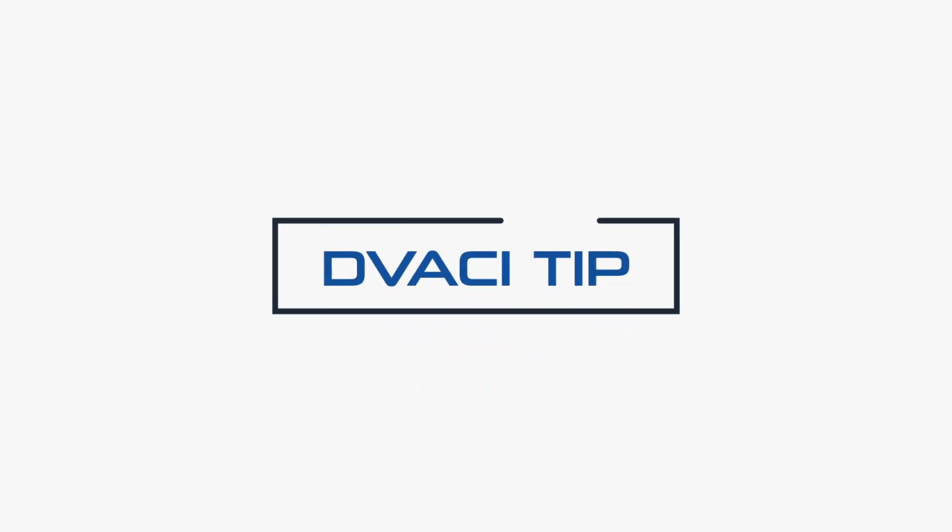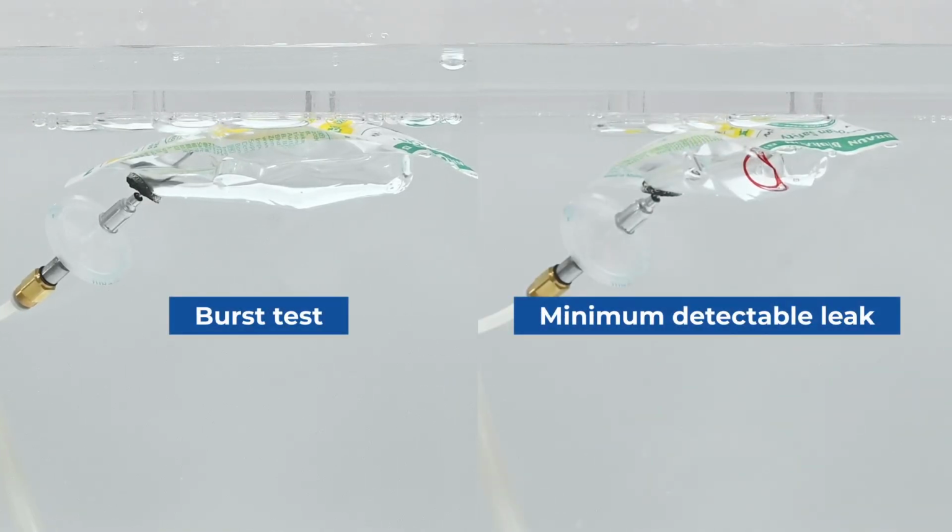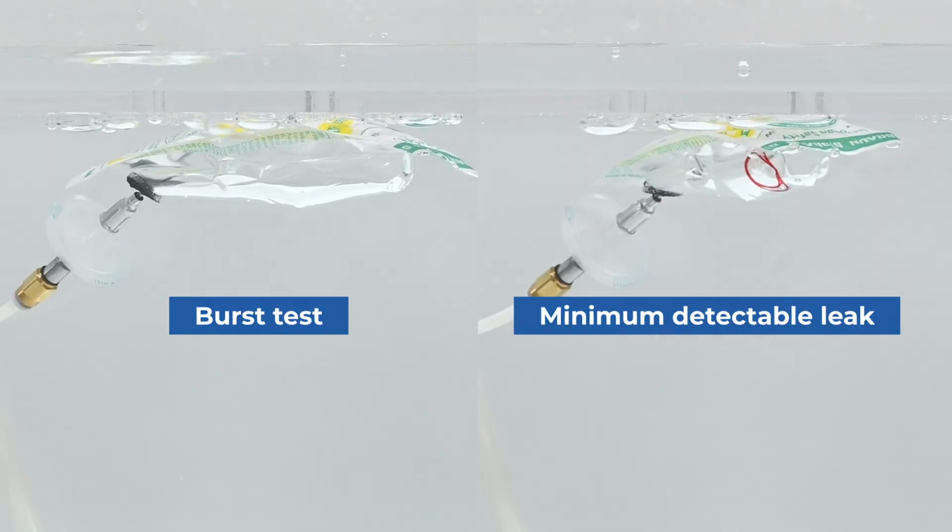Here is a tip that almost no one applies and that can significantly improve test reliability. Perform a maximum pressure test or burst test. Although it is not part of the standard method, it is extremely useful. Increasing the pressure until the package fails allows you to identify its upper integrity limit. When you know both where the minimum detectable leak appears and where burst occurs, the test pressure becomes obvious, safe, and defensible during regulatory audits.